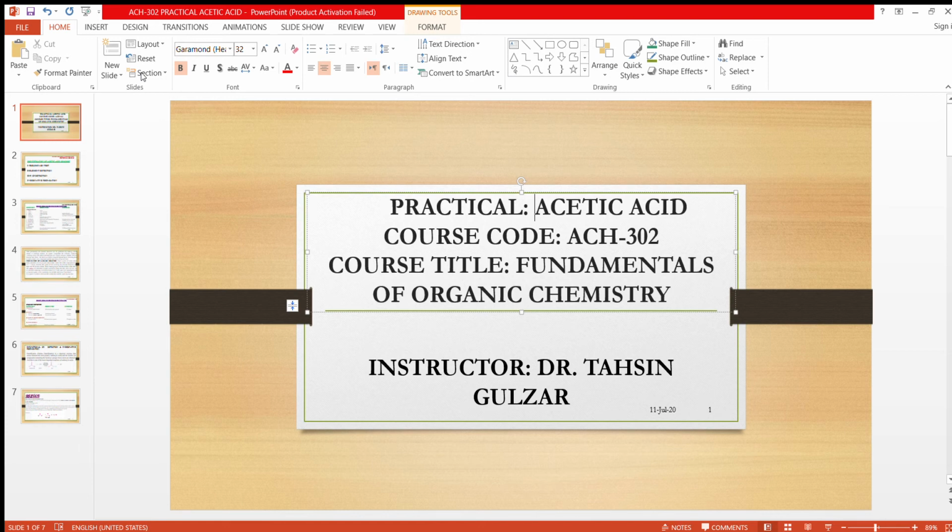So that will be completed, and then afterwards you have to prepare sodium extract. I have written it, and you have to write in your practical notebook about the preparation of sodium extract, which is also known as Lassaigne solution, Lassaigne extract. You can use three words: sodium extract, sodium fusion extract, and Lassaigne solution. All three are correct.